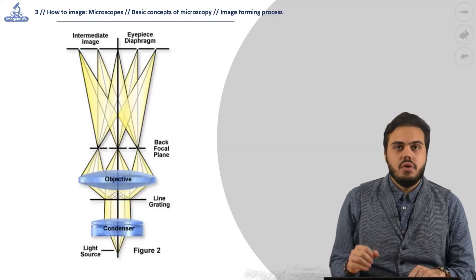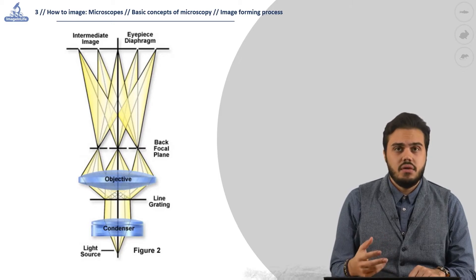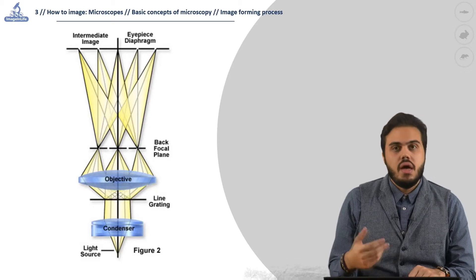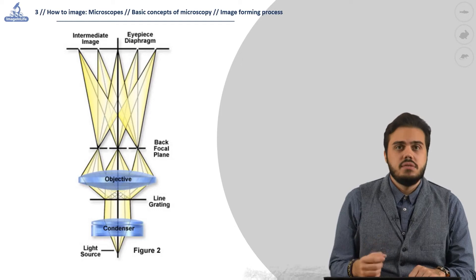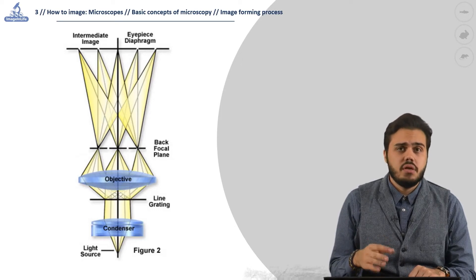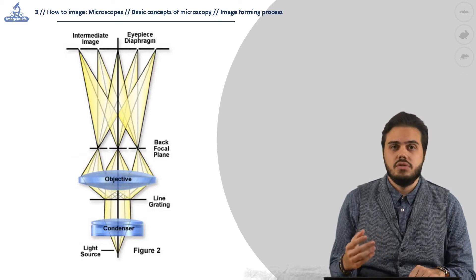When we talk about image forming we take in consideration the physical aspect of the light, the different components of the microscope, and the nature of what we are looking at. This means that image formation is a complicated process that can differ in practical aspects based on the different technology we are going to use.